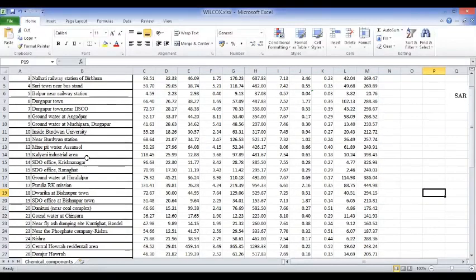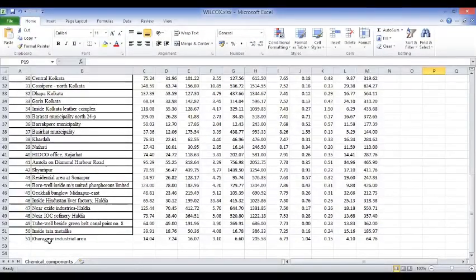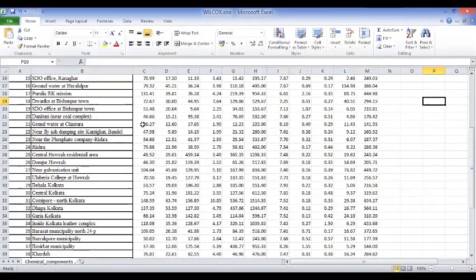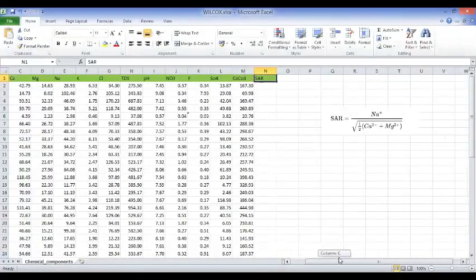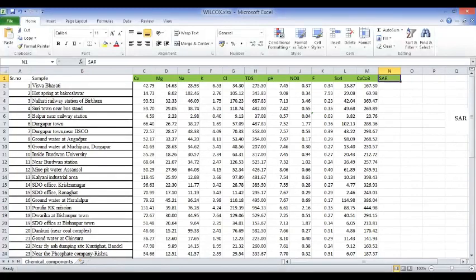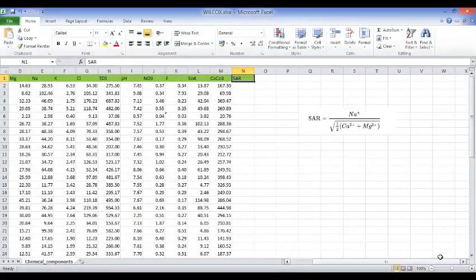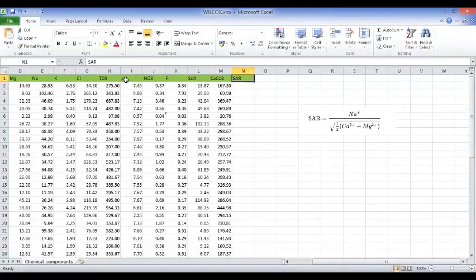We have parameters of 51 places. The various parameters include SAR, which we have to find out. If we don't find out SAR, our statistical technique will give erroneous results. SAR is not something you can measure directly like pH or TDS of water — we have to calculate it.